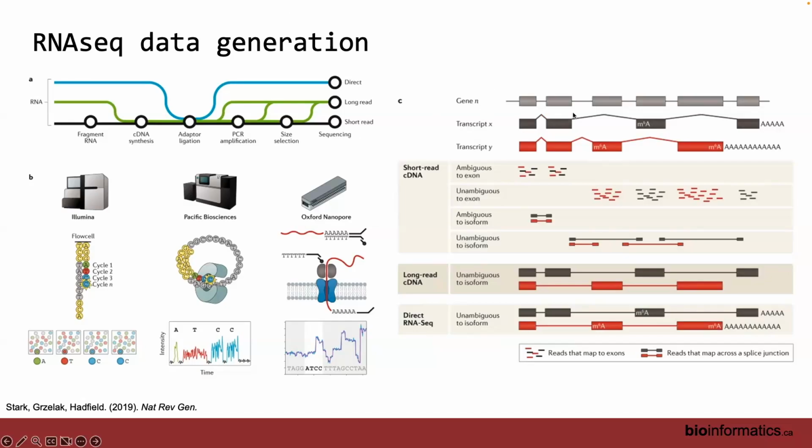And so the thing you have to remember is that sequencing RNA is not the same as sequencing DNA, because with RNA, if you've got a particular gene, you can have multiple transcripts of the gene. And one of the problems in RNA-seq is transcript quantification. So you have to see which parts of the nucleotide sequence belong to transcript 1 versus transcript 2, and vice versa. And so when you have a gene expression quantifier, it's got to be transcript aware. It's got to know that this gene has that many transcripts, and you get that information from a gene database.